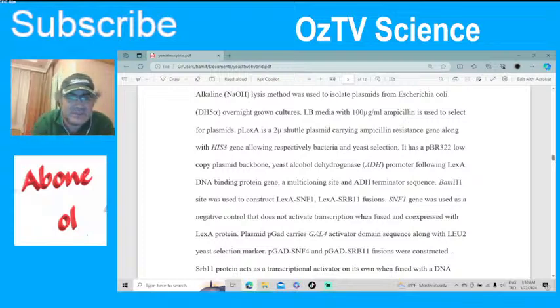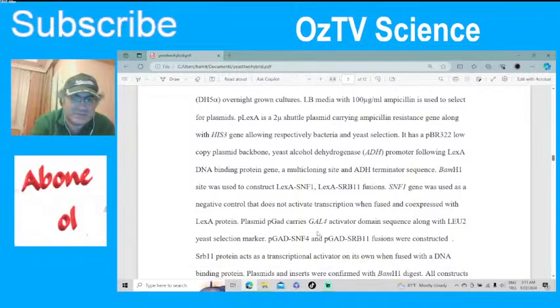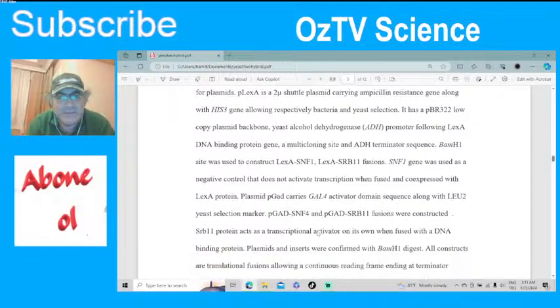That's why they put the beta-lactamase gene inside the plasmid, so that they can work with bacteria or make more plasmid. And another selector, the HIS3 gene, so you can select in bacteria and yeast. It's a low copy plasmid. It also has the alcohol dehydrogenase promoter followed by the LexA DNA binding protein gene.